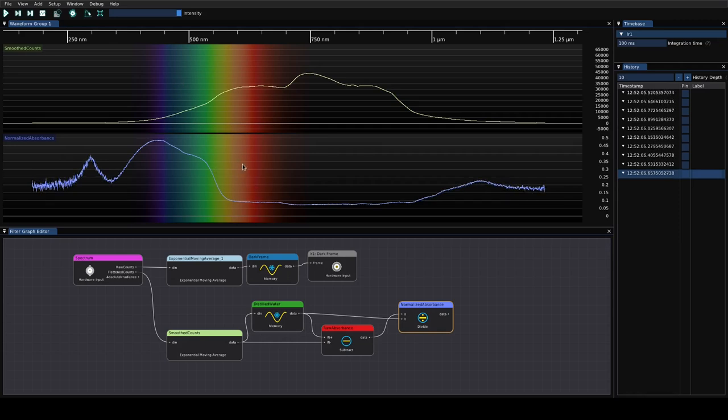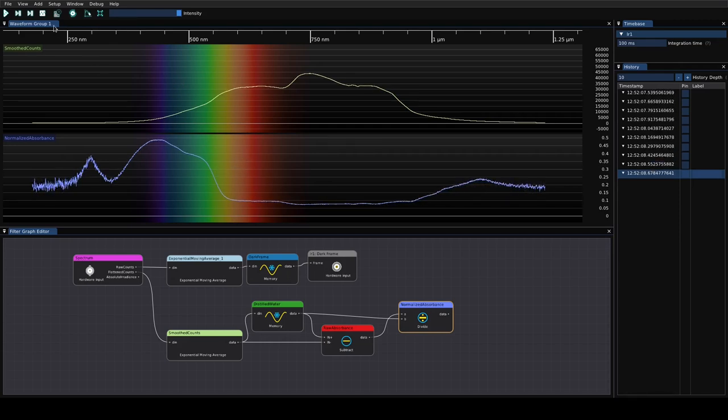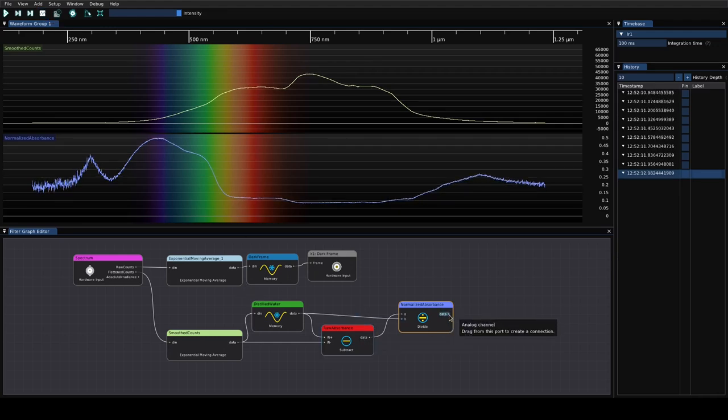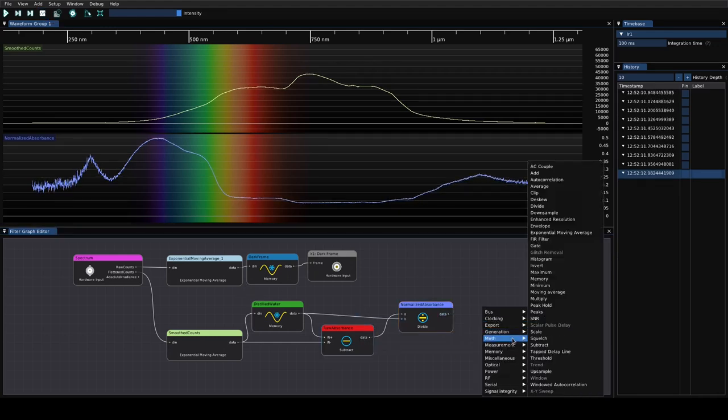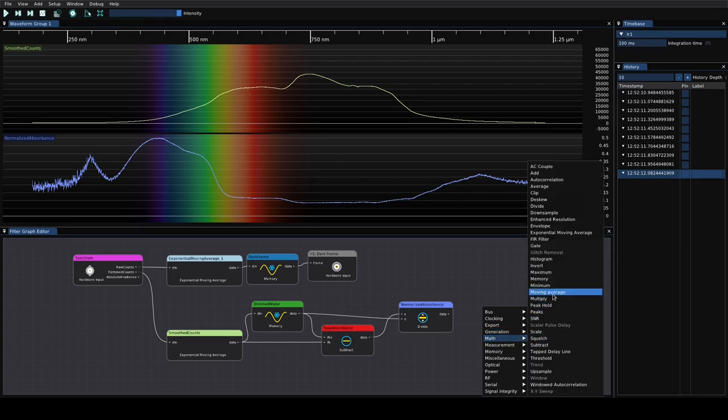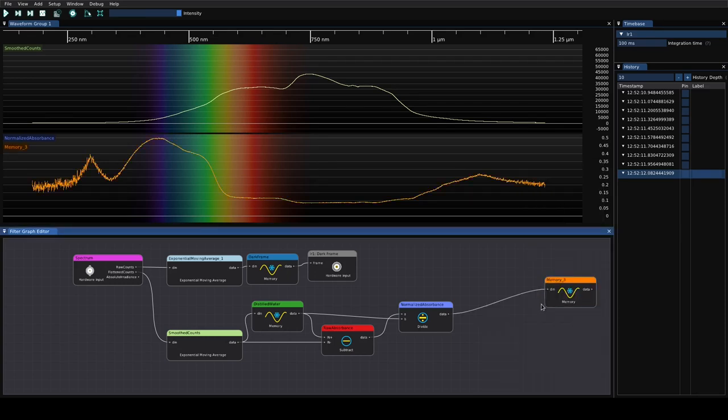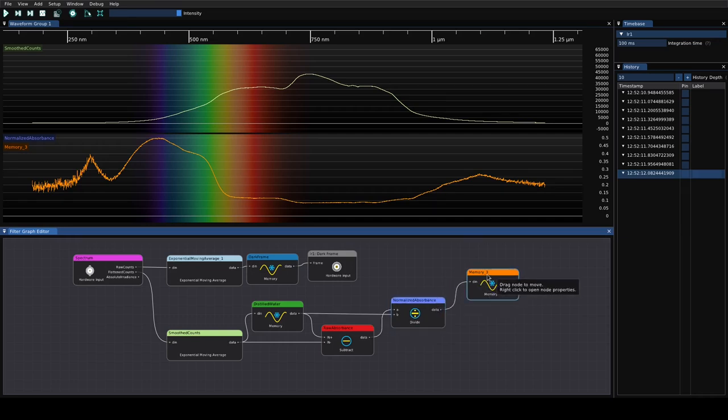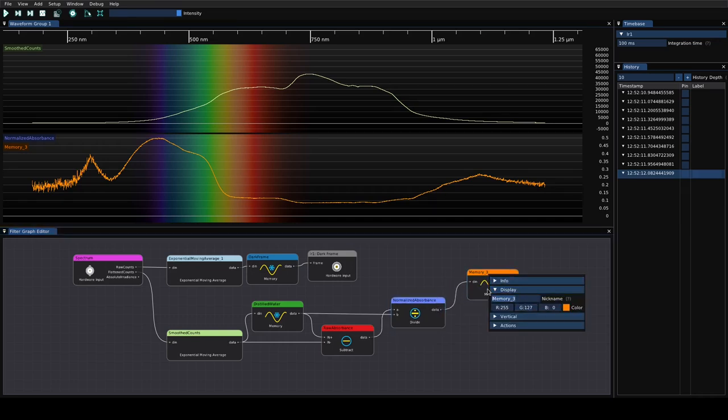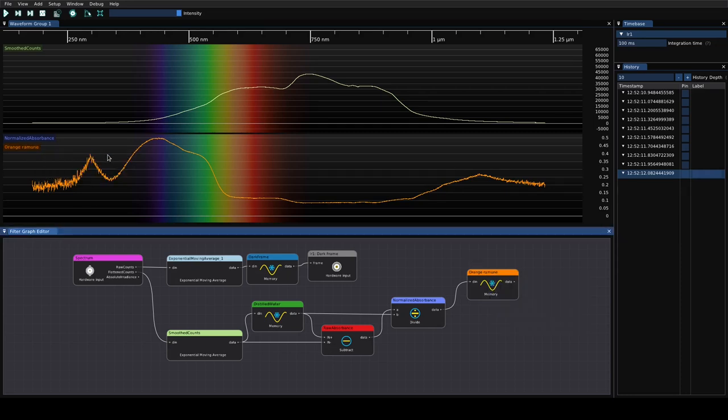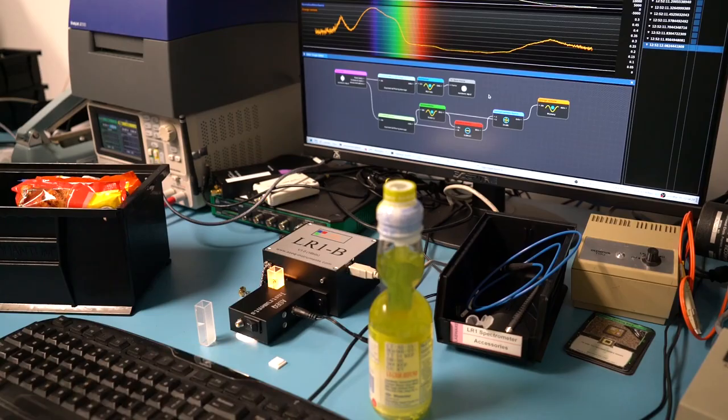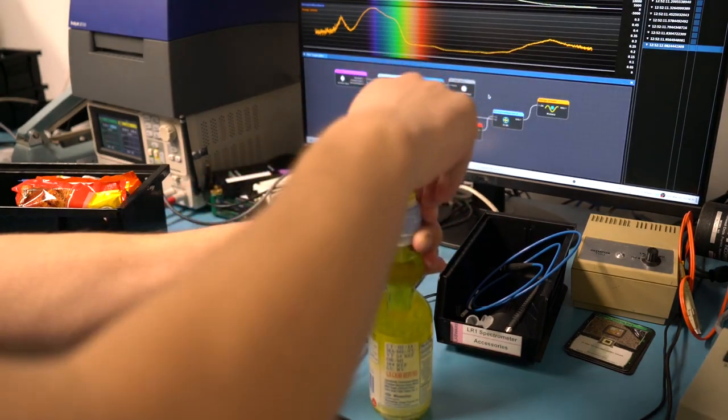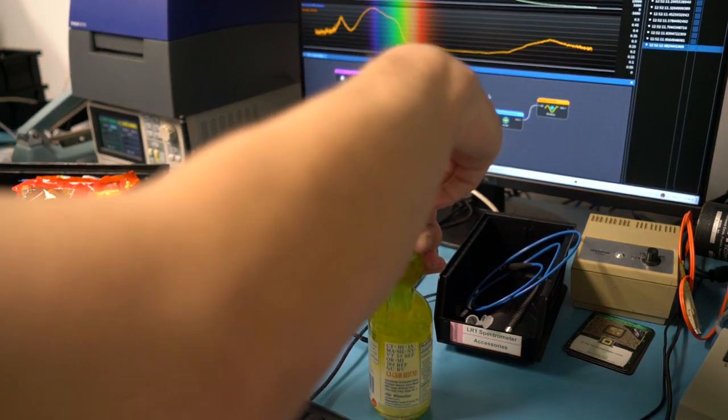We'll take a reference spectrum of this. It's still moving around, the bubbles are really messing with the spectrum. We're just going to call this good and stop our acquisition here. We're going to take a memory trace of this and call this our orange Ramune. We'll save that waveform and then we can do some samples of some of the other flavors and see if we can actually tell them apart.